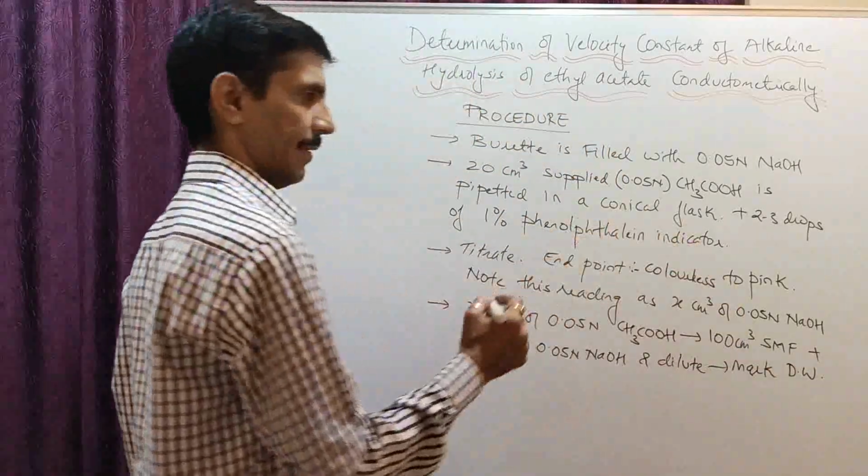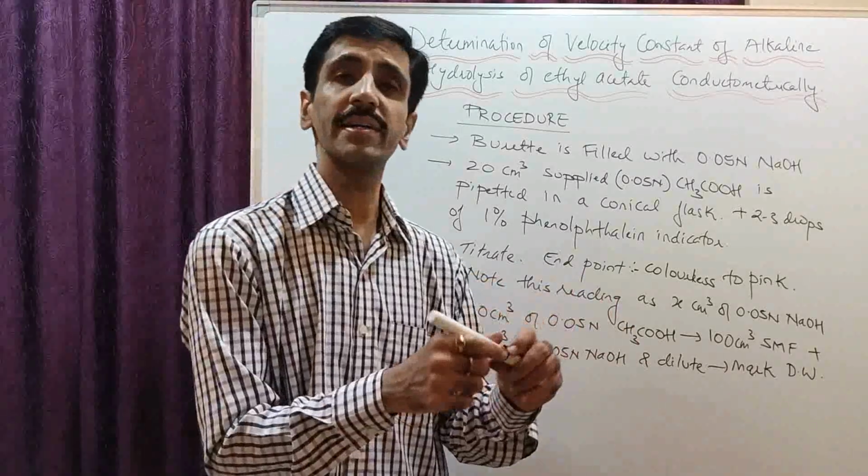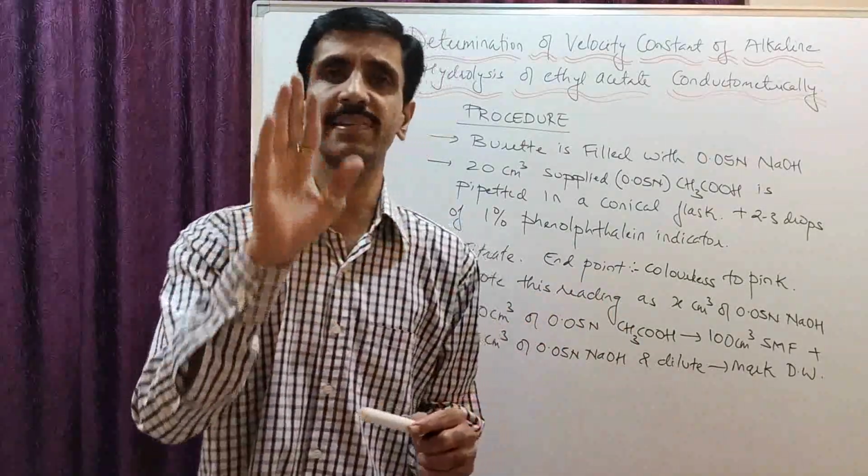Okay, mark means 100 cm cube. With what? Distilled water.